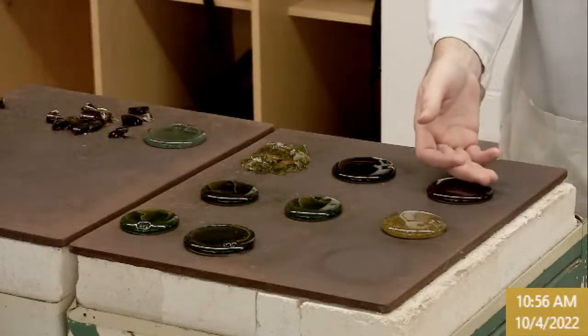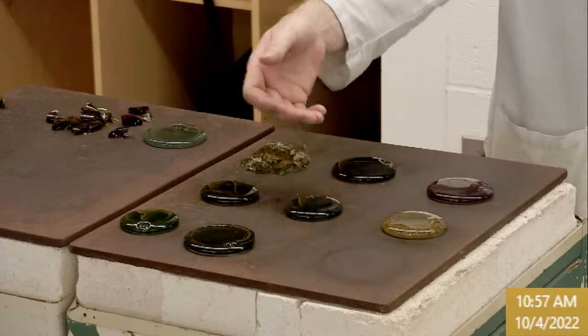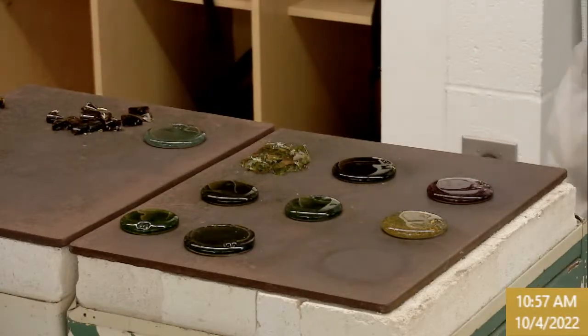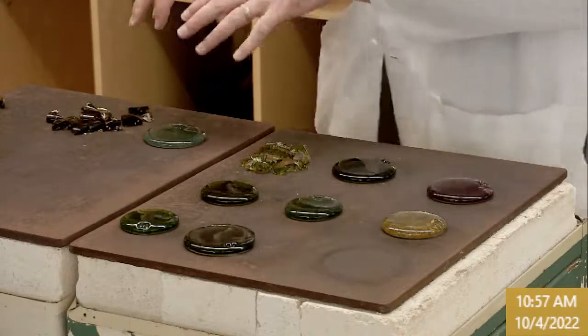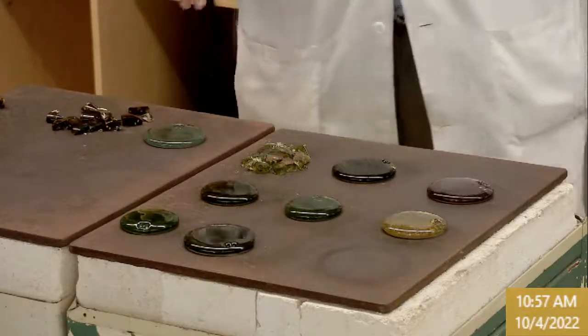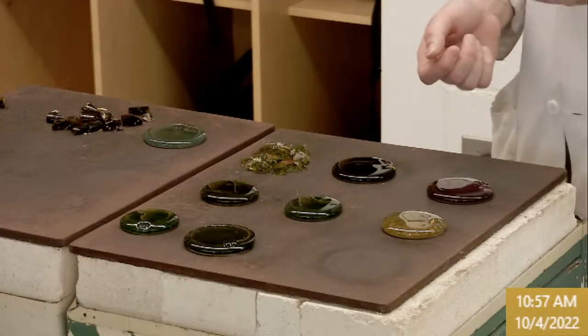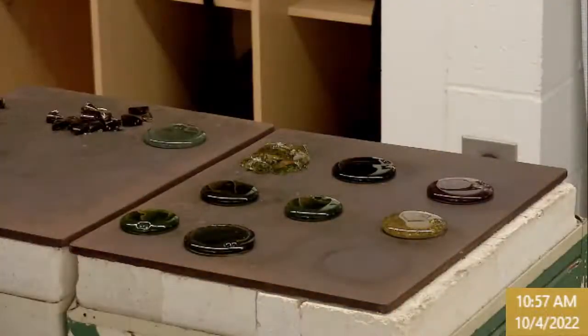All right, so let's see. Only slightly painful, that's progress. So what we'll probably do here is go ahead and do some preliminary measurements. Like I said, don't touch the broken shards, don't touch fiberglass, it's bad. Definitely wear your goggles. The things are stabilizing up here now, but if I were to handle them now, I could still make a cold spot and it could possibly shatter. But we can take some ruler length measurements on the ones that survived. And once we get a little bit cooler, we'll move it over here to the light table and look at internal stress fields. You can take pictures of all this, obviously, too. There are rulers over there, so feel free to grab that, start getting your preliminary measurements, and I'll let you know when we can move them over for the full inspection.